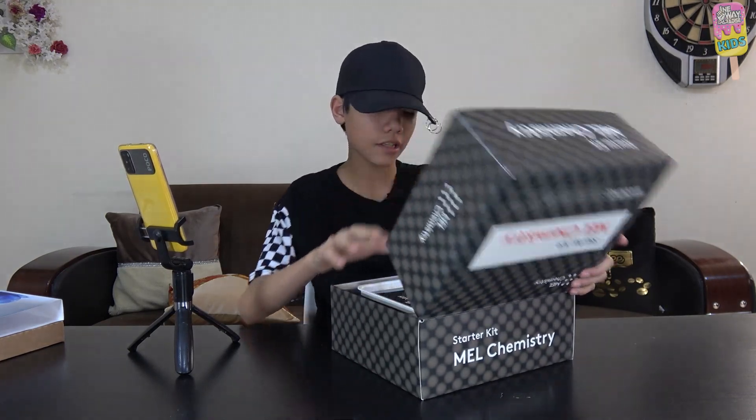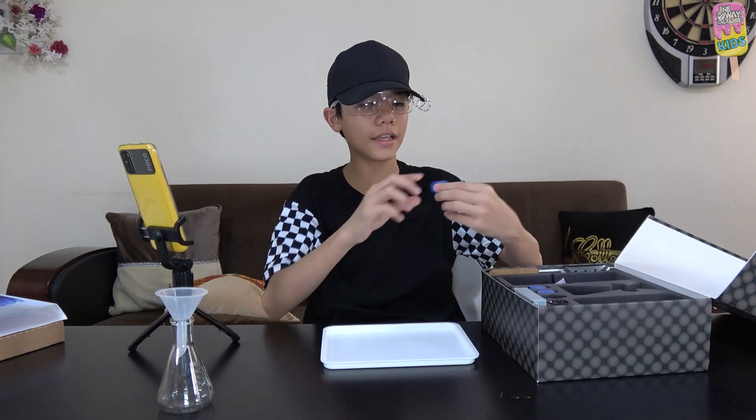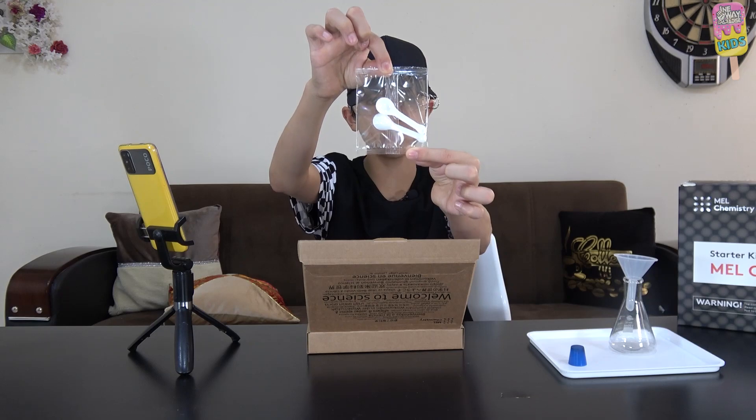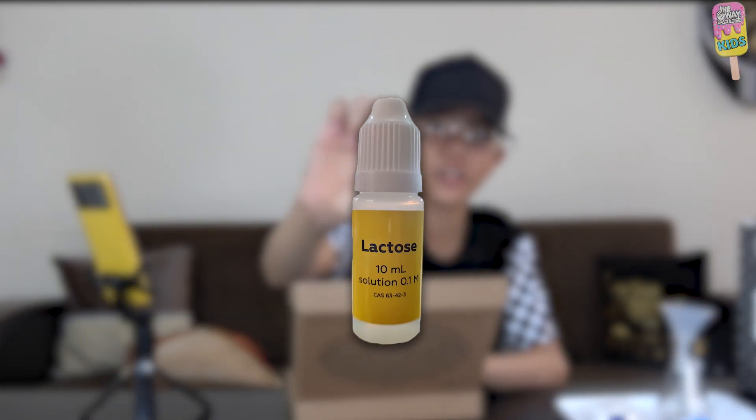We're first going to prepare some hot water in advance. Now that the hot water is boiling, we'll take some stuff from the starter kit: the funnel, the glass flask, safety glasses, the plastic tray, a rubber stopper, a double-ended measuring spoon, gloves, pin opener, some calcium hydroxide, lactose, and lastly some methylene blue.